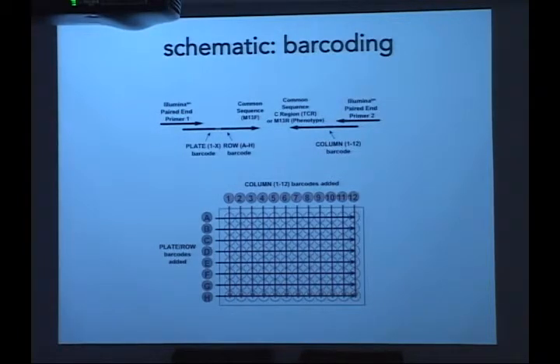So based on this, you can put about 25, 30 different plates on one reaction pretty easily and get data from 2,000 to 3,000 cells using one Illumina run with current technology. And this current technology is really expanding. So once we get the Illumina reads, basically now you have 25 million reads or so, and you have barcodes on each particular cell, and you have cytokine transcription factor sequences as well as TCR sequences.